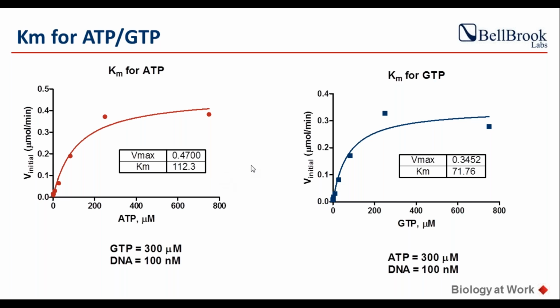Again, it depends upon the kind of assay that has been used and the kind of DNA that you use. We used ISD in this case, but it differs if you are using a full length 45 kilobase pair DNA or just 45 base pair DNA.